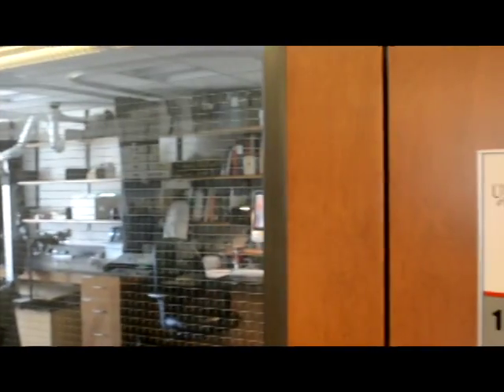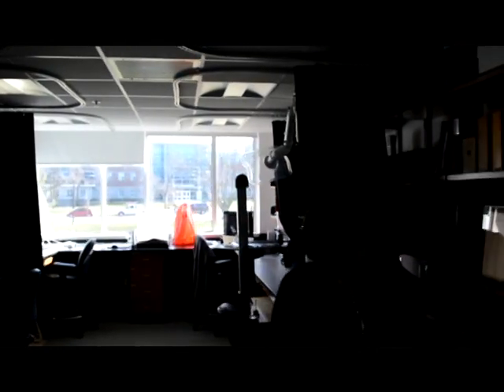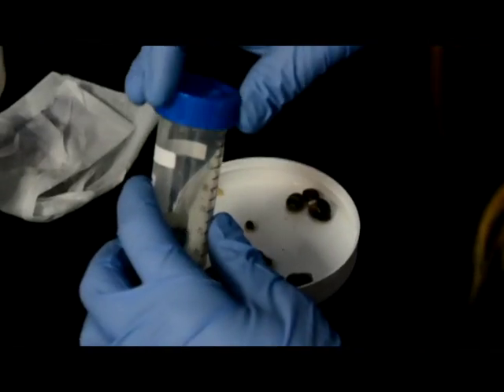For every species we analyze at our institute, we also make at least one photograph. This will help researchers later on, for example, if they want to check species identifications. All images are stored in the same database as the DNA barcodes. Our collections group has various equipment that helps them to photograph organisms of different sizes.